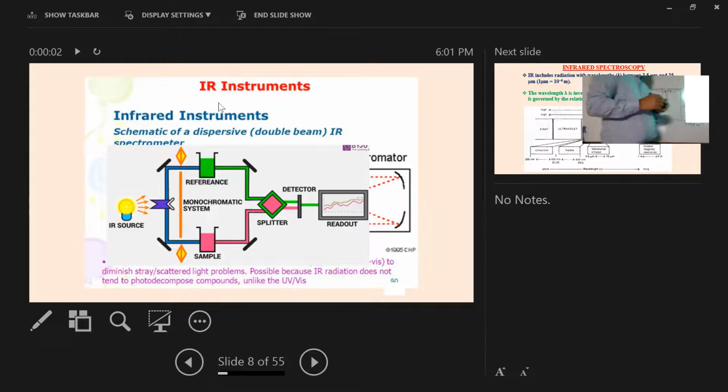So that is for any instrument, if the signal intensity is very high compared to the noise, this is our noise, what I have mentioned. So this is not our interest, but every instrument has some noise. That means the signal does not correspond to our expectation, and the instrument, due to some electrical defect, can have some increase in the signal.